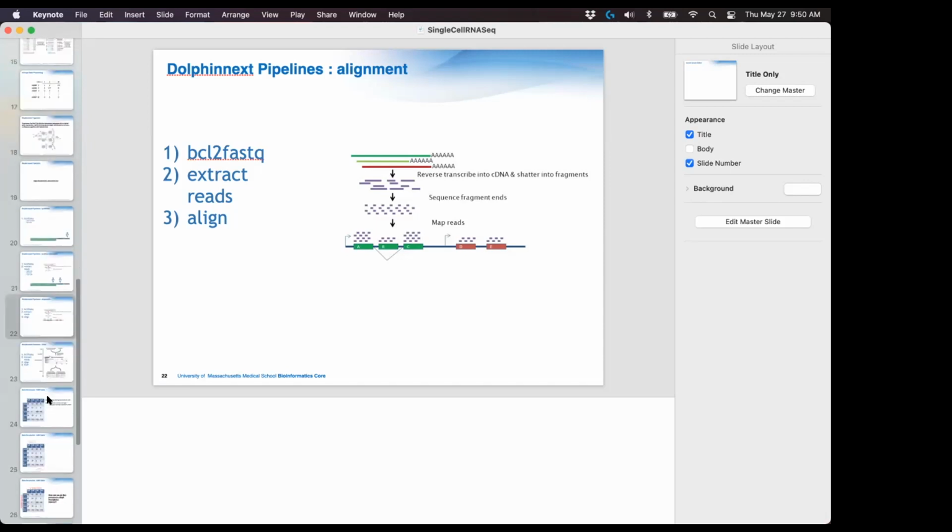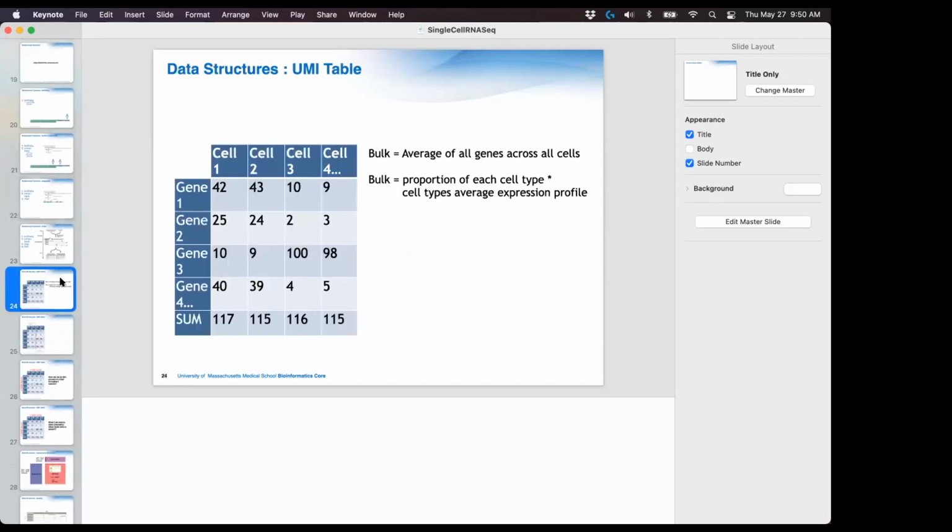The ones we're working with today are only about 3,000 to 4,000 cells, so that's a relatively small data set, but it's still a full flow cell. We usually do about 3,000 to 4,000 cells per high output flow cell, and a high output flow cell gives you on the range of 10 to 50 gigabyte FASTQs. The BAMs are 1 to 5 gigabytes each.